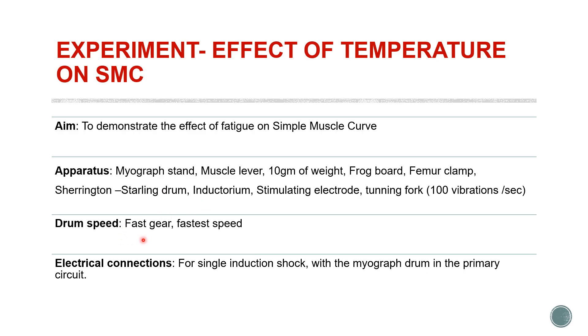The drum speed here is fast gear at the fastest speed. For the electrical connections, we are using single induction shock with the myograph drum keeping it in the primary circuit.